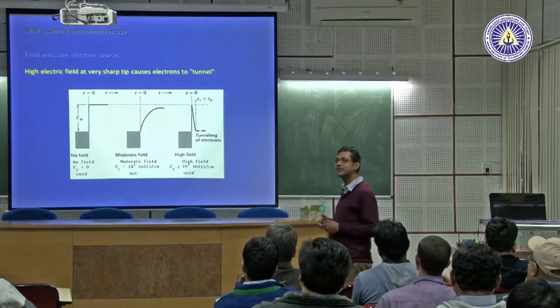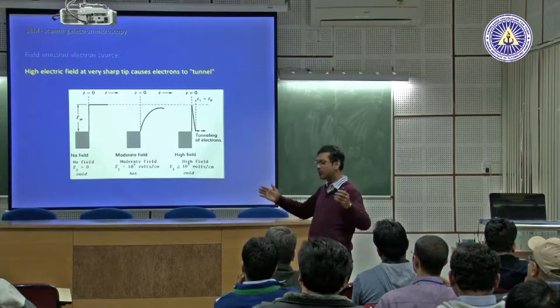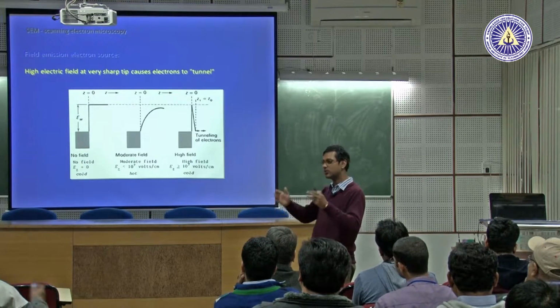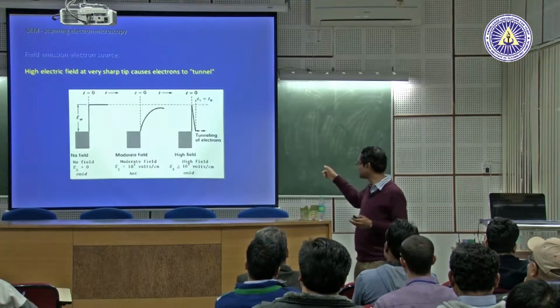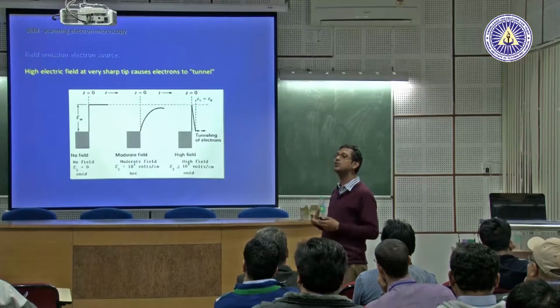First advantage is that wavelength is not changing, but your aberrations are reducing, so that you can reduce the width of the electron energy by using this tunneling aspect. Second is that your source is brighter.